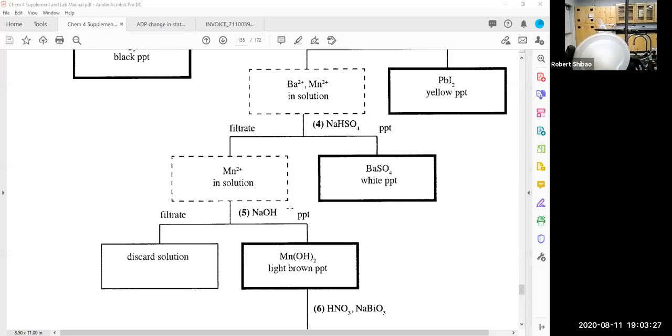And this completely dissolved. So what that was, was lead-2 chloride that I just couldn't get to dissolve. I didn't have enough water to dissolve it all. So that was the situation. And so it was kind of very tricky because things don't always work like you expect them to. And sometimes it's more difficult to interpret the results.